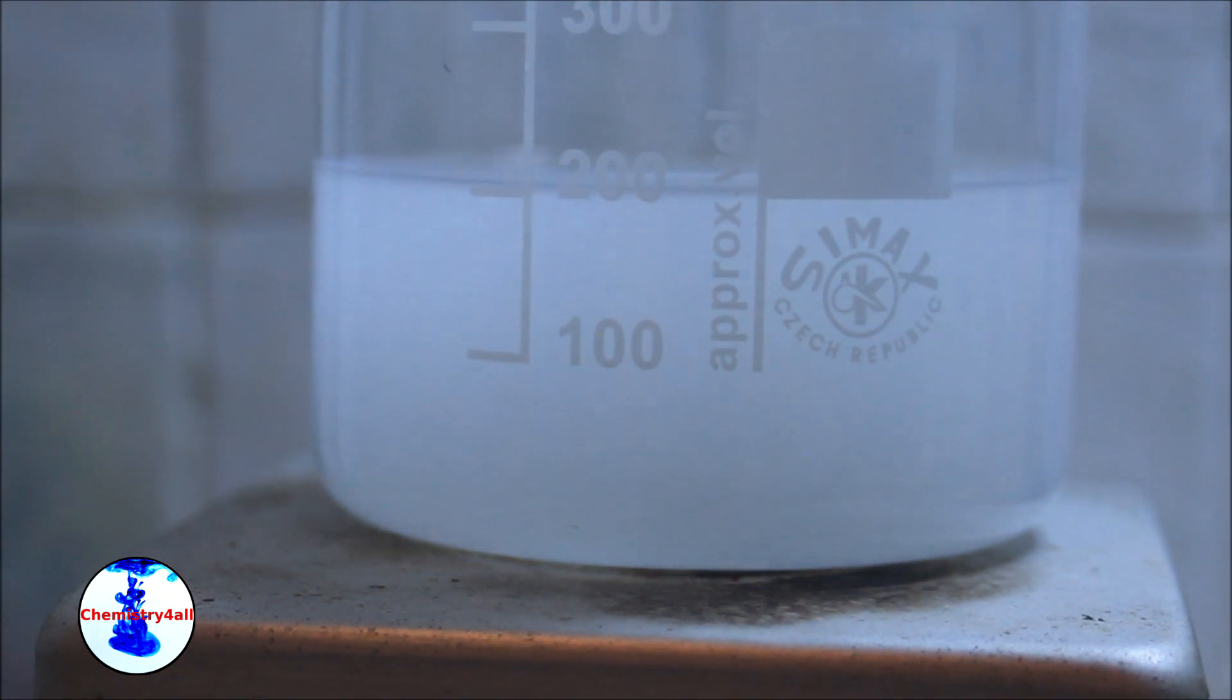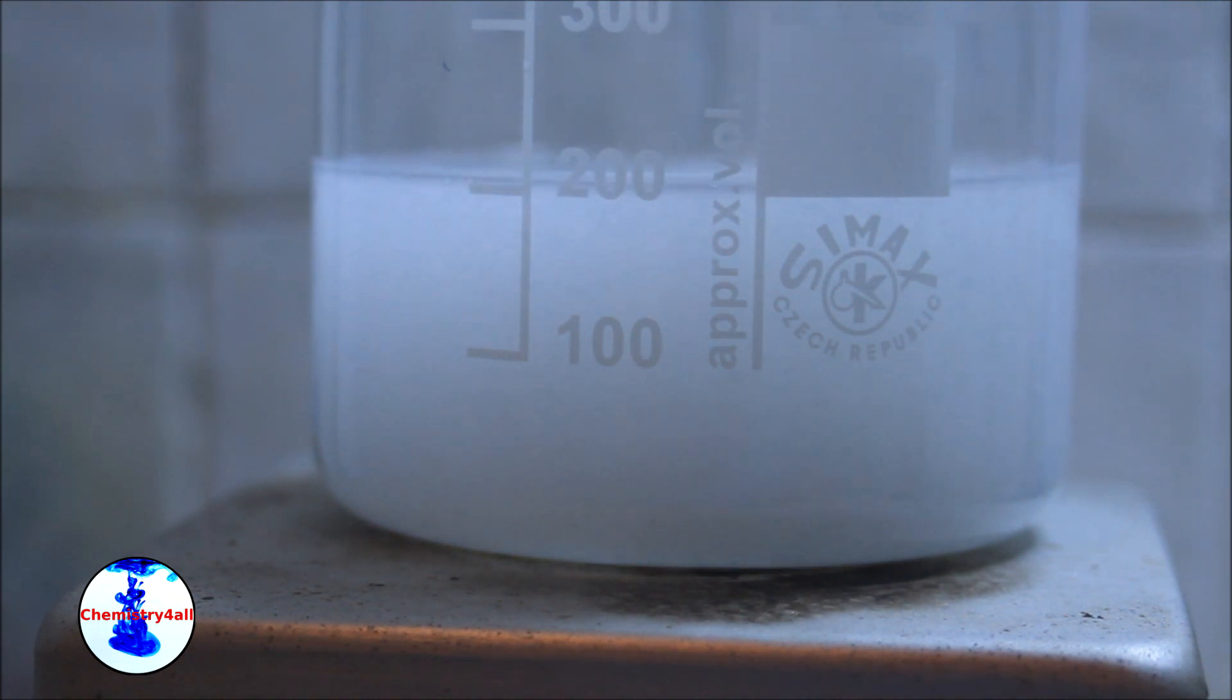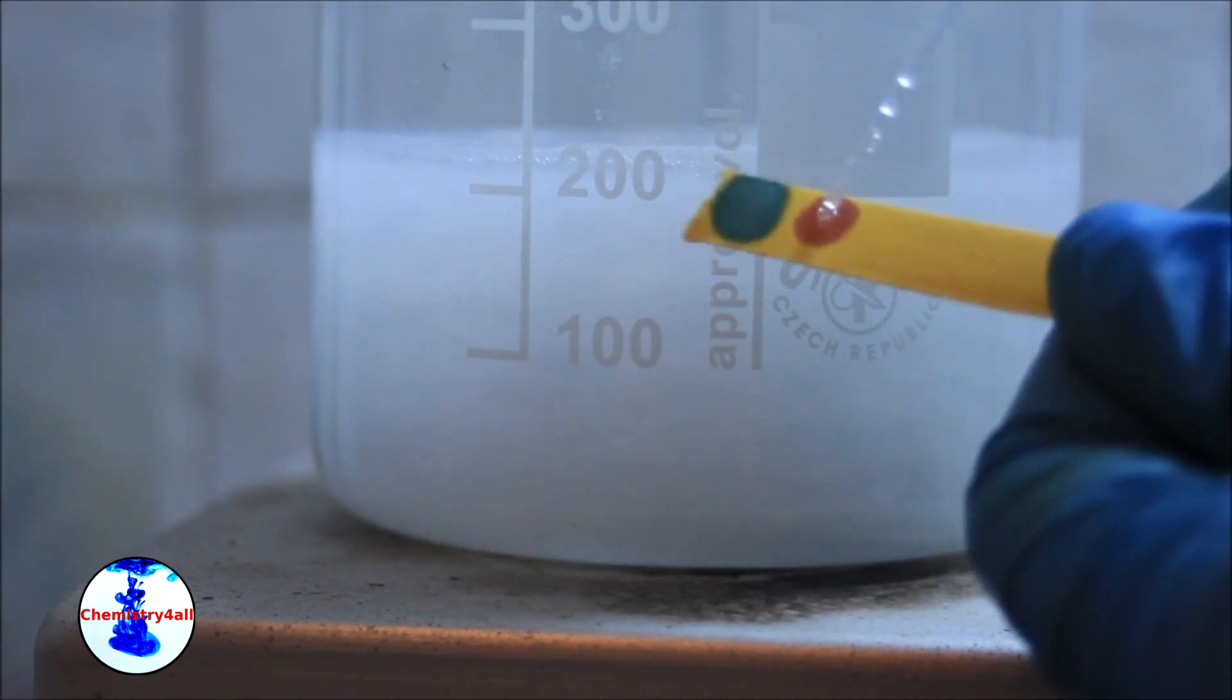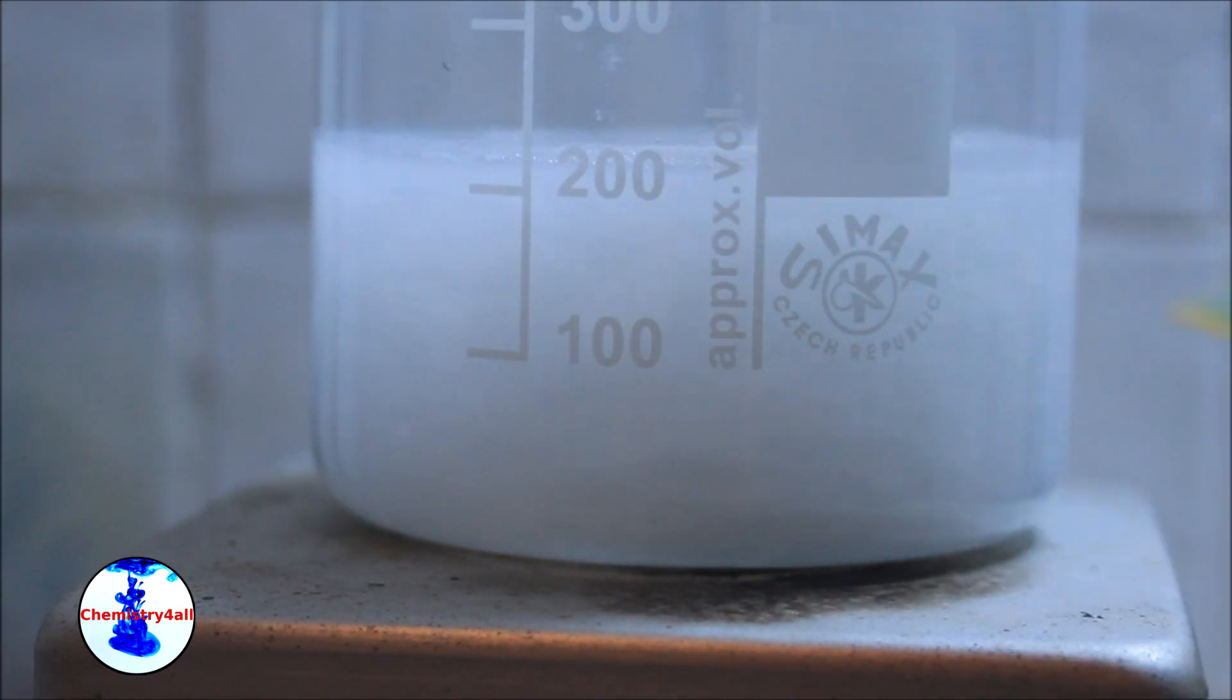This is done by adding small amounts of concentrated hydrochloric acid until we get an acidic pH. Ideally the final pH should be below 3 to ensure that all the product is in its insoluble form.